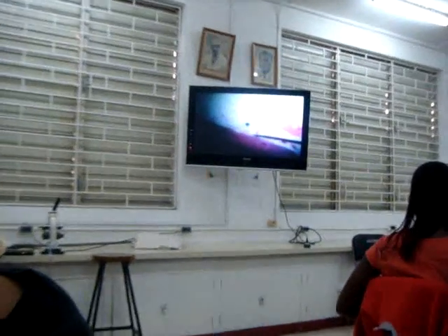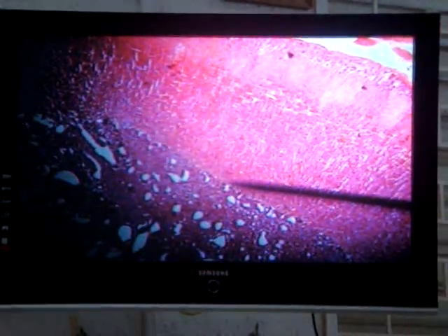Just to complete the endocrine system. Now, the first thing is to tell you that the adrenal gland is one of only a few slides in your box that has an outer cortex, which is this area here, and an inner medulla. One of the few slides in the box, maybe about 5 or so slides, possess a medulla and an outer cortex.